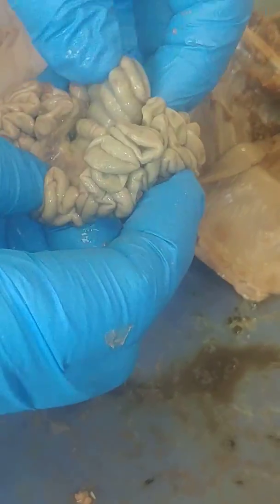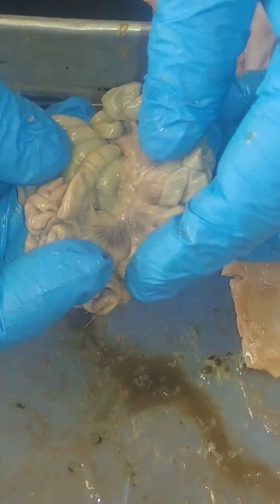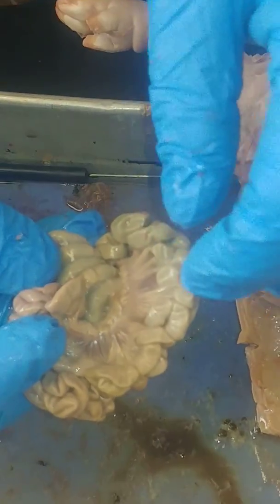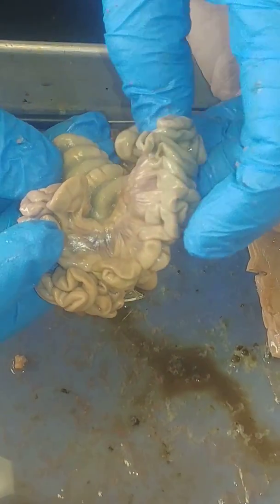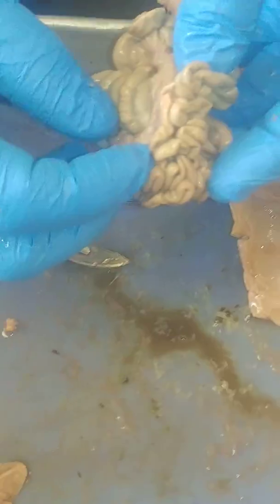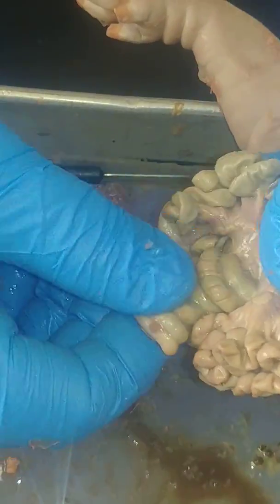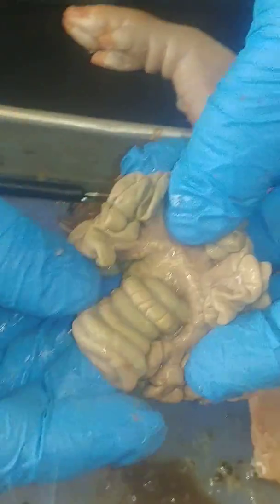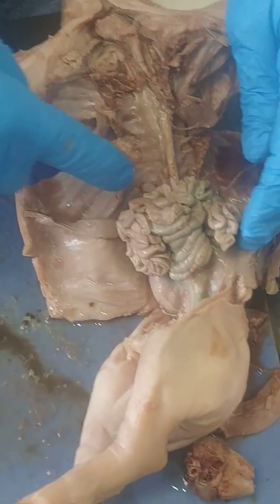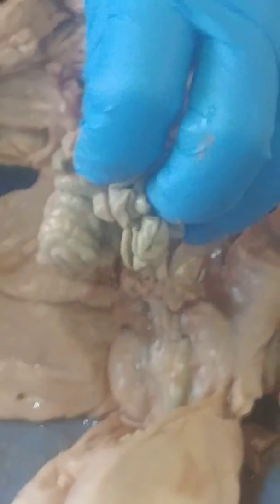And it all fits in a nice bunch. Now there's a membrane that's holding this together, and if you remember seeing this on your frog, a little fan-like thing right there, that's called the mesentery. So it carries blood to the intestines, but it also carries nutrients from the intestines to the circulation. Again, here's a real nice example of all this soft, squishy stuff right here. Small intestine, solid, more tubular-like setup here is the large intestine. On humans, it would be going like this. It goes up and around here. So the large intestine's arranged just a little bit different on a pig than it is on a human.